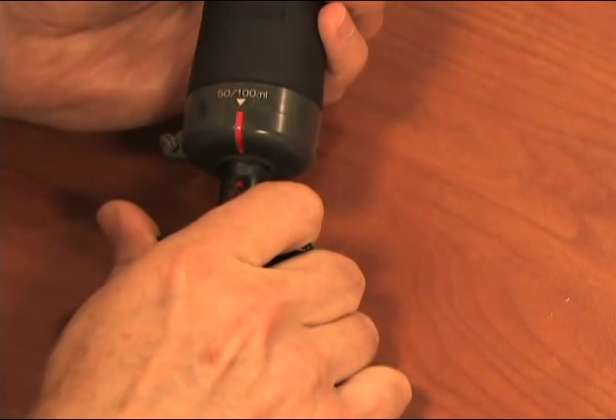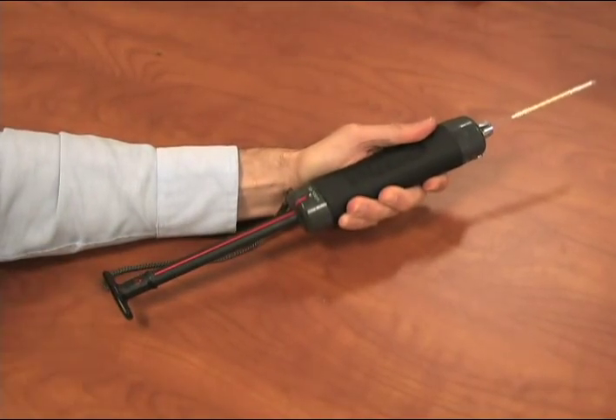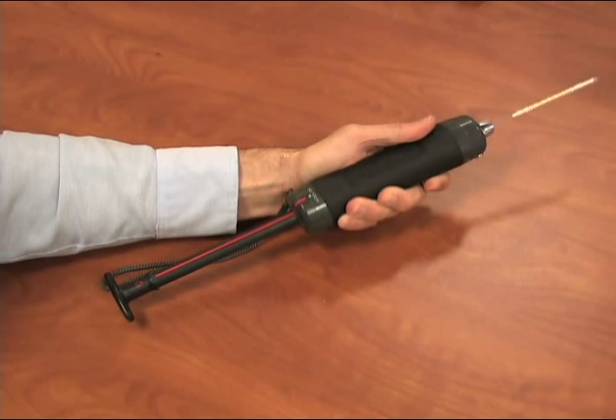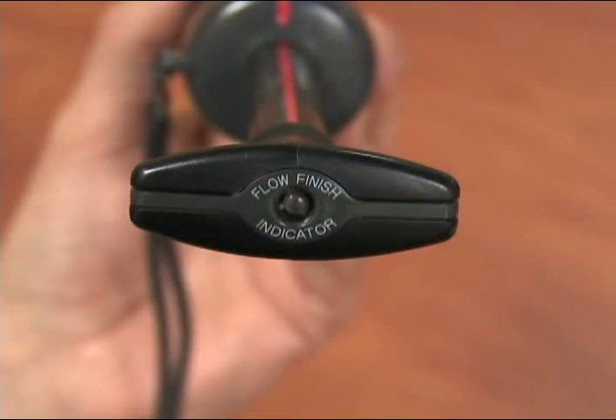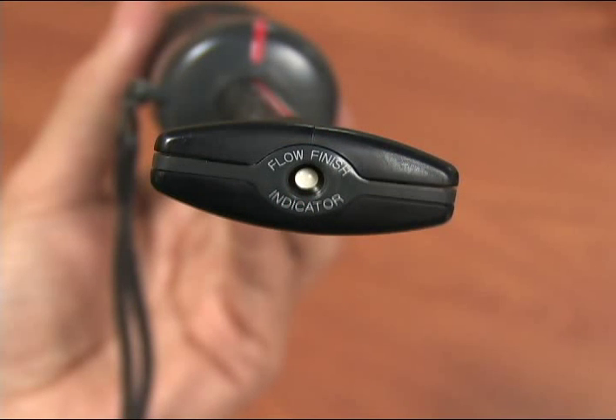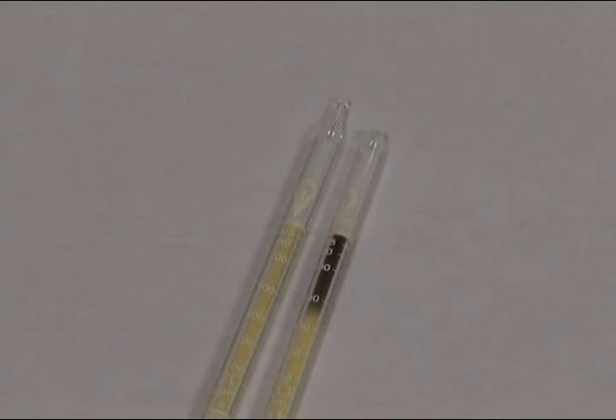Make sure the pump handle is all the way inside the piston body and align the guide marks on the pump body and handle. Pull out the handle all the way until it locks — one pump stroke is 100 ml of air. Wait until the flow finish indicator on the handle pops out; this will take approximately one and a half minutes.